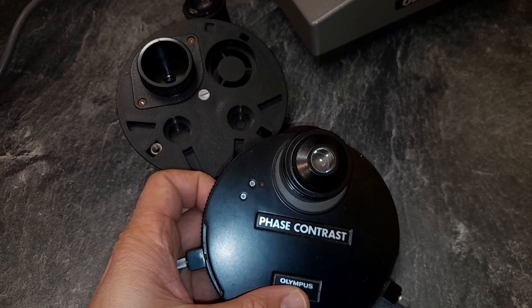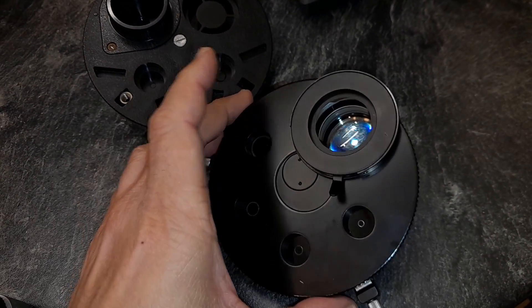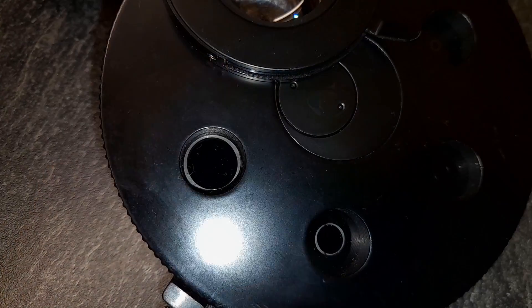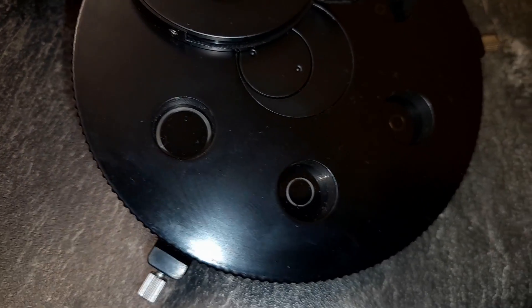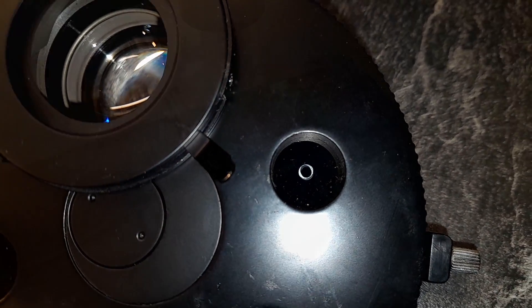Now, this condenser here is made of metal. It's significantly heavier. And look, it also has more phase annuli for different magnifications as well. And in this case, there is a glass disc in there, which was blackened out.